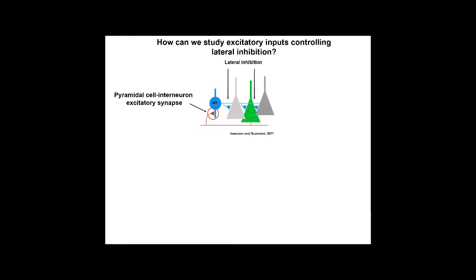And we also want to understand the short-term and long-term plasticity. During this talk, we're going to talk mostly about the organization and the dynamics of these synapses, not considering how this relates to place tuning and learning. In the next part of this series, Sam McKenzie is going to talk about how the place tuning of cells in CA1 and the plasticity relates to these interneuron and pyramidal cell interactions. But for now, this is a deep dive into the organization and dynamics of pyramidal cell interneuron organization, and we're going to use these micro LED probes to take an unprecedented look at that circuit.